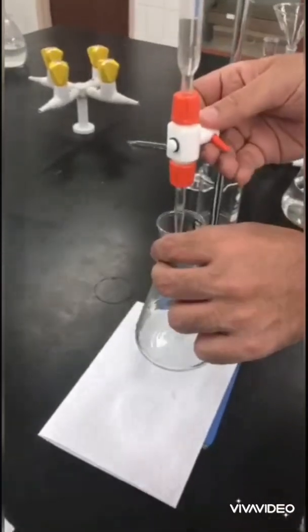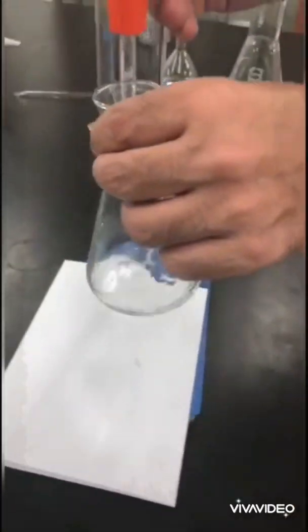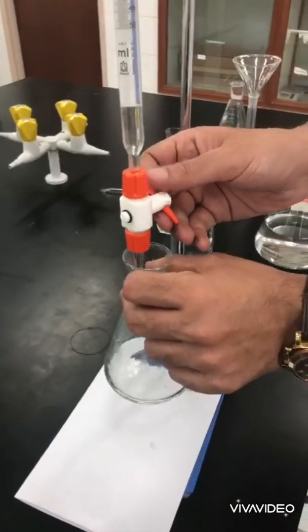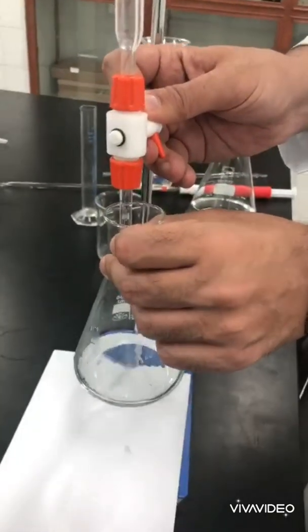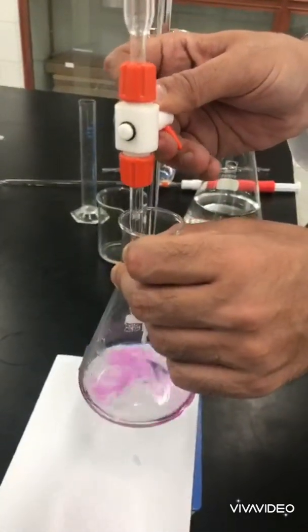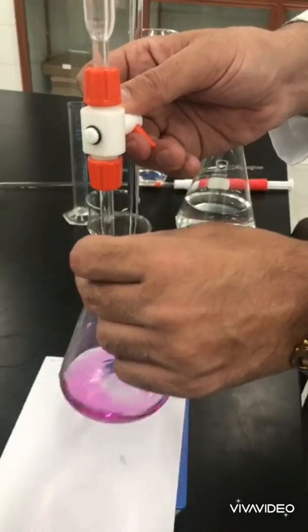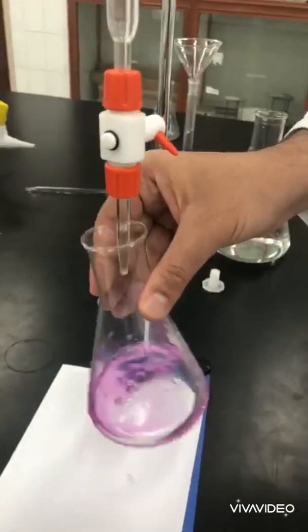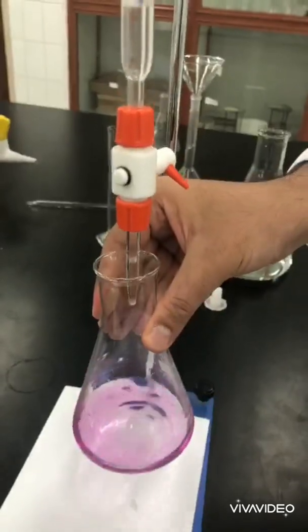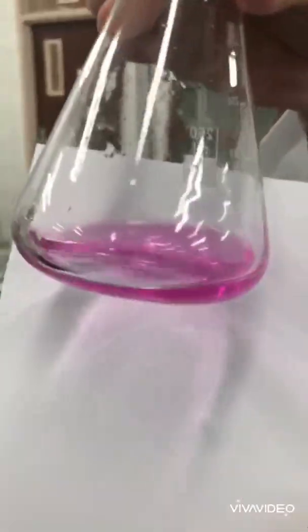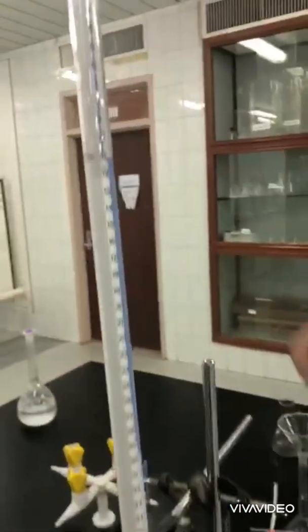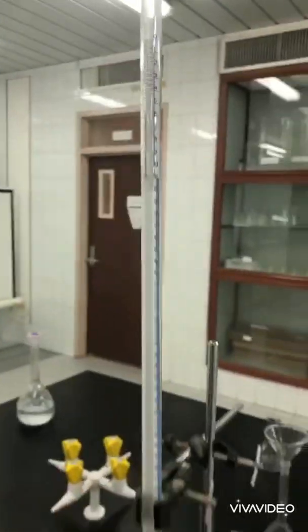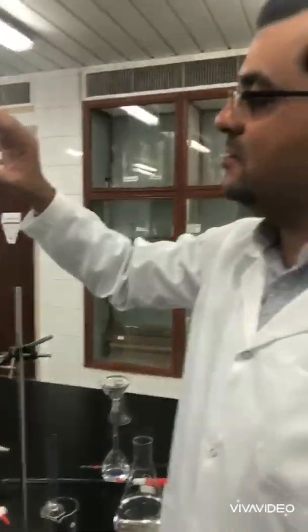As you can see here, the pink color. The entire solution became pink. I'll wait until the color is stable. Yes. Okay, here let's take the volume now. The volume is 10.9 milliliters. Record it. It's 10.9 minus zero, which means the volume of sodium hydroxide used is 10.9 milliliters with HCl.